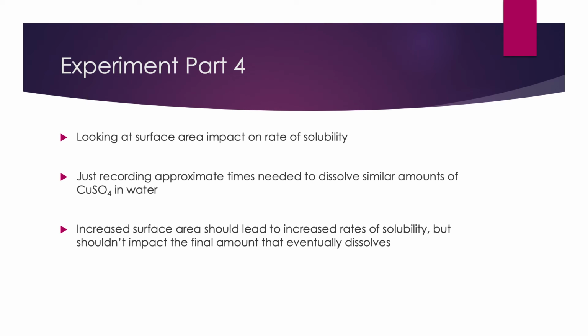All right, that's really all the main things for this week's lab. This week's lab is a little bit on the shorter side because, like I said, it's very observation-based. The only part where you're actually doing any calculations is the very first part, where you just have to make sure you get your masses and volumes in the right units. Then the lab will walk you through a decent number of unit calculations and manipulations while answering some of the post-lab questions.